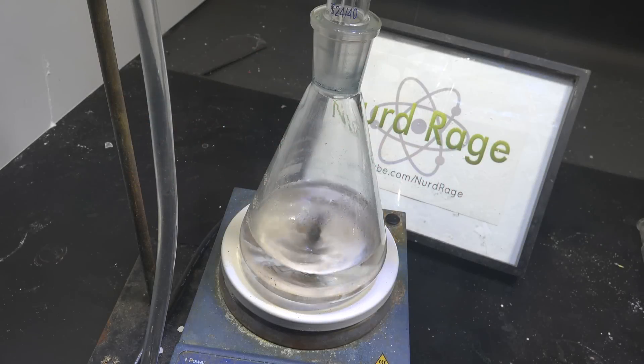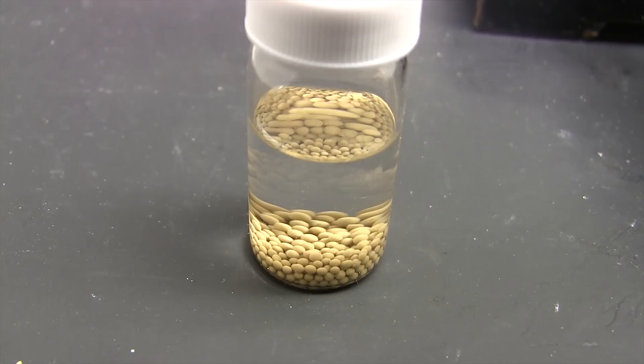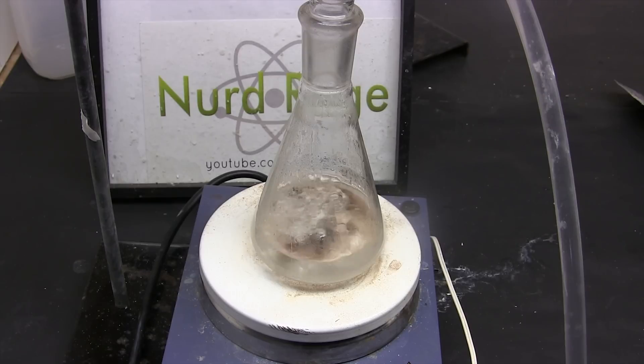Greetings, fellow nerds. I wanted to make more ethyl propionate so I'd have a good stock available in case I made more mistakes in my synthesis of pyrimethamine. In a previous video we made ethyl propionate by the classic process of acid-catalyzed Fischer esterification between ethanol and propionic acid.